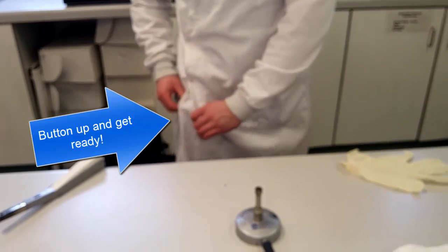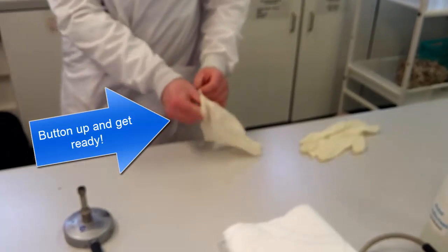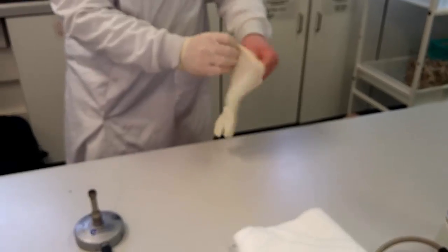Today, as part of our video presentation, we will be performing CFU counts, which will include the following: serial dilutions, spread plate technique, and counting colonies.